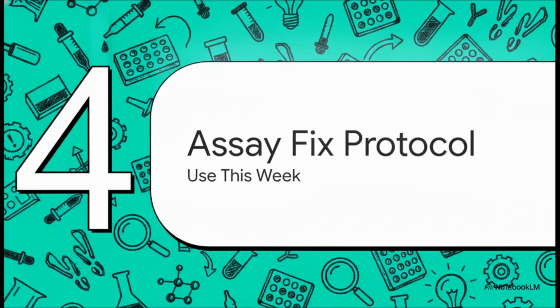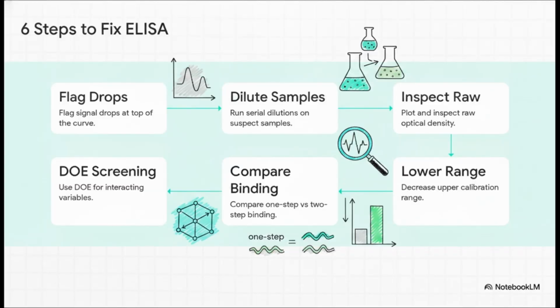Let's move along and see how this all builds in to Section 4, Step-by-Step Assay Fixes. This is a protocol you can actually use this week. We've identified the core issues, and now I want to give you a rigorous, bulletproof path forward. Here is a precise 6-step protocol for the bench.